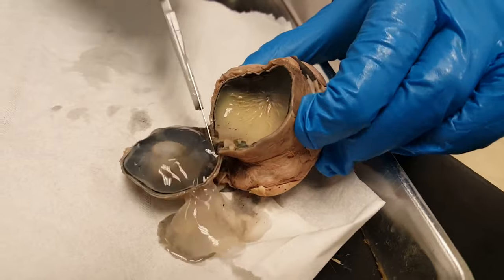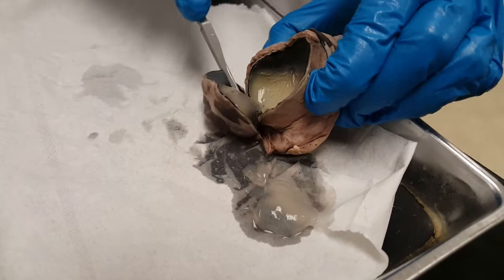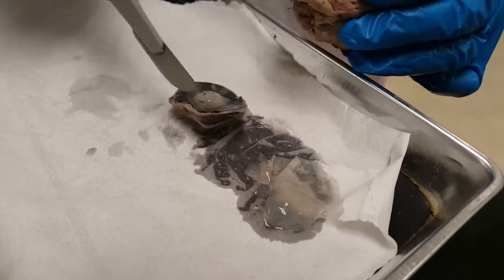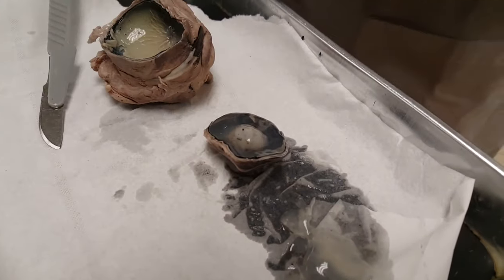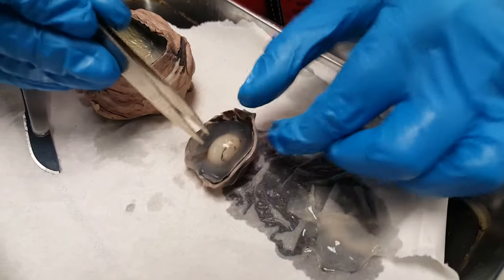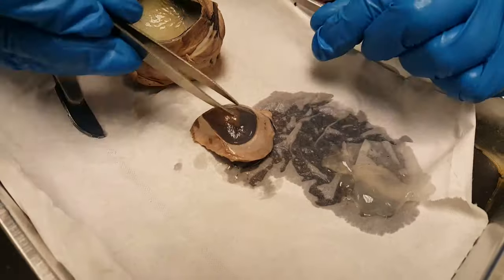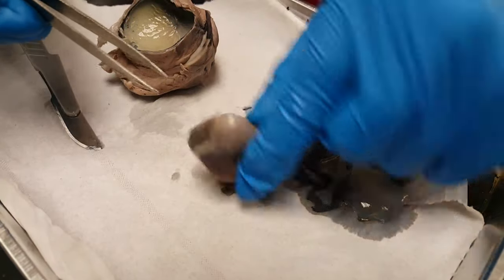That jelly-like fluid that comes out is the vitreous humor. This thing in here that looks like a Mentos is the lens — you can pull that out of the fluid. You can see the relationship of the lens to the cornea.